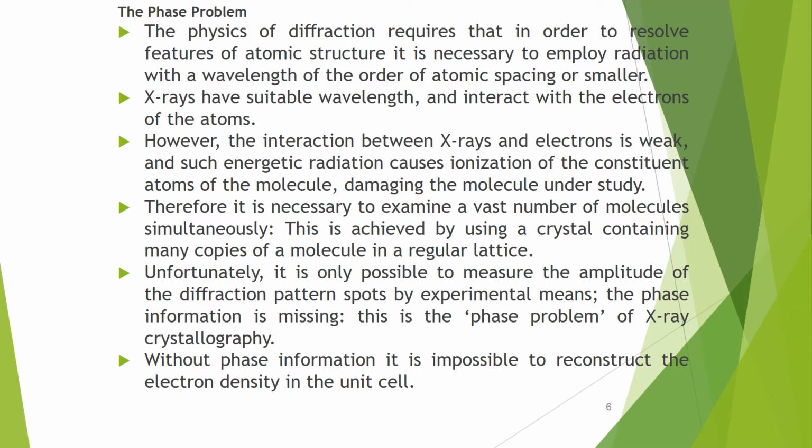However, the interaction between X-ray and electron is weak, and such energetic radiation causes ionization of the constituent atoms of the molecules. Damage to the molecules under study occurs. These are some problems that we find in using XRD techniques.